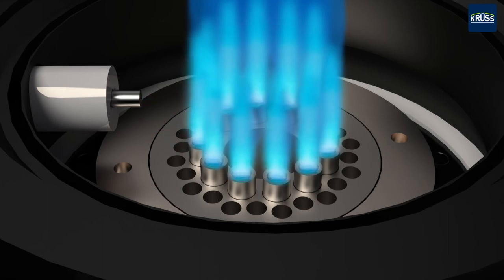A consistent and stable flame is crucial for consistent measurement results. This is achieved with 12 gas outlets that create an optimal flame geometry.